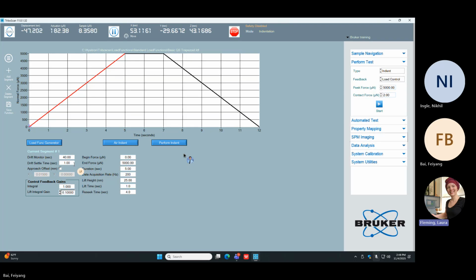What I mean by that is, okay, your system had, I think it was 0.6 nanometers per second drift at the end. And I told you the worst I generally see is 1 to 2 nanometers. Let's take that 1 nanometer per second drift rate as an example. The same customer, cow eyeball woman, she is a testing extreme for many, so she makes great examples. Her indents were all going about 4,500 to 5,000 nanometers deep, and they were 12-second indents like this. So if we think about that, at worst, the drift rate I would expect to be 2 nanometers per second.